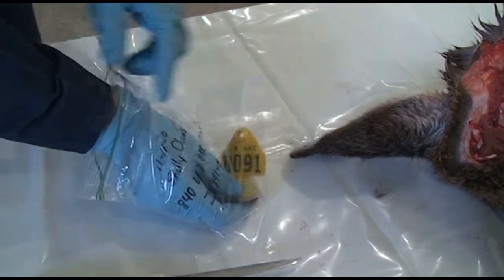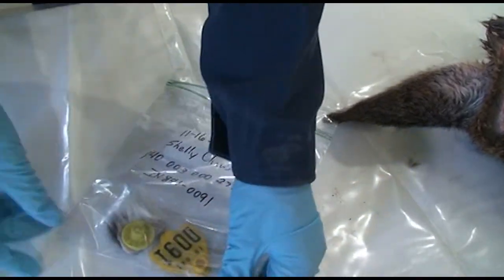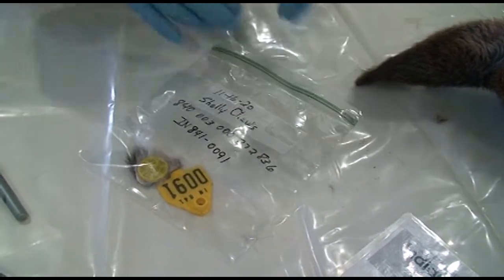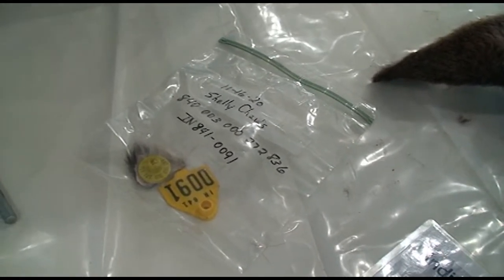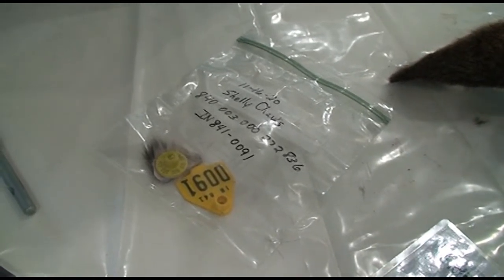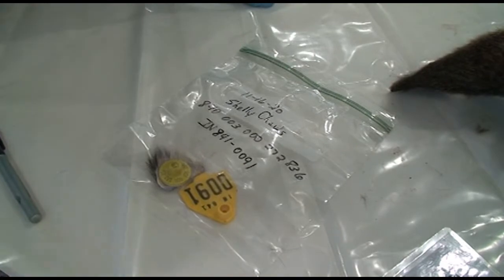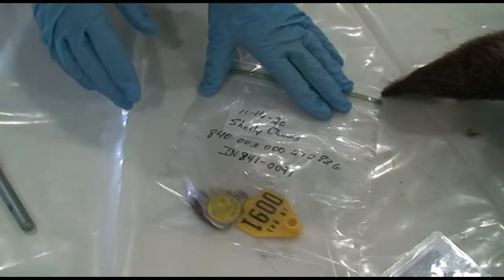Now, with sending the ear tissue, you don't have to send an ice pack with it, but they do need to get sent to the lab within a day, 2 at the most. Anything sent to the diagnostic lab, Purdue University in Indiana, as long as you send it UPS, will get there next day. And so that's the easiest and the cheapest way to ship it, would be to ship it UPS. And you don't have to pay extra for next day if it's going to the diagnostic lab from anywhere in Indiana. So this will be your fresh tissue bag that'll go.